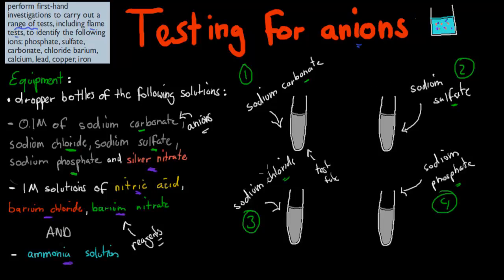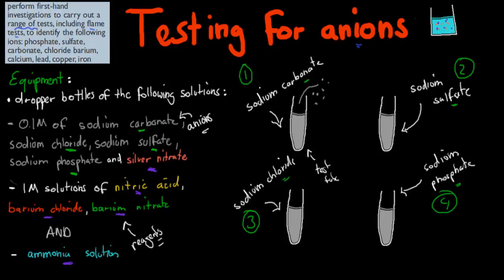You can do the sequence in any way you want. We'll start with sodium carbonate and keep to the sequence. If we have nitric acid, we add it into the solution. What happens is the test will confirm that there's carbonate present by producing bubbles — gas bubbles are signs of carbon dioxide. Carbonate and acid react to form carbon dioxide and water, which shows that carbonate is inside the solution.